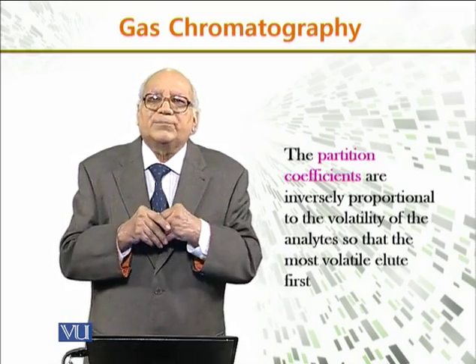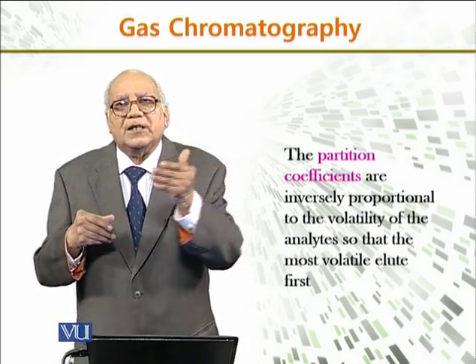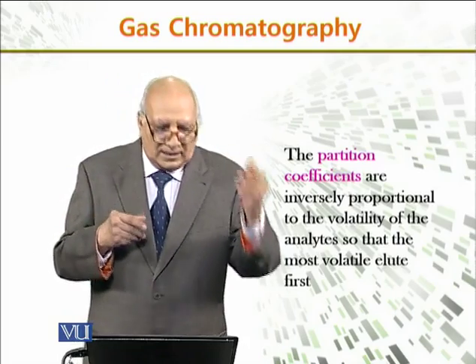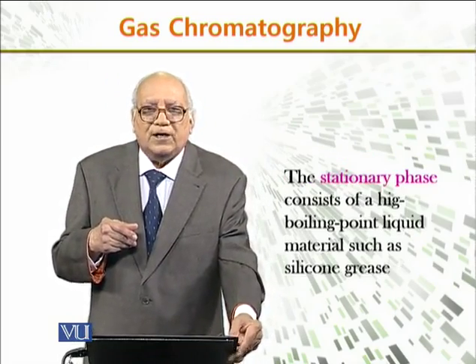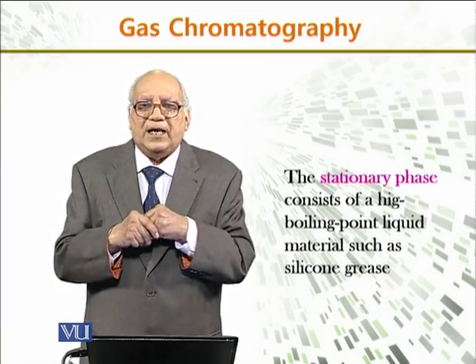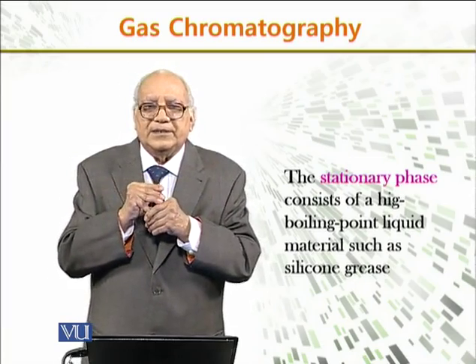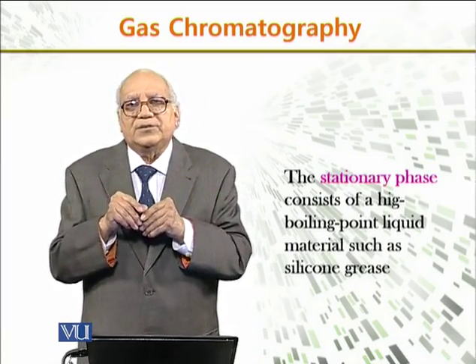Definitely, the compounds which are most volatile will come out of the column first, and then the other compounds will follow. The stationary phase consists of a high boiling point liquid material such as silicone grease.